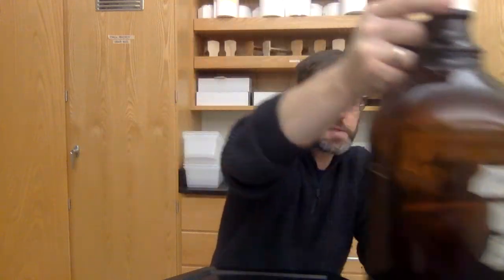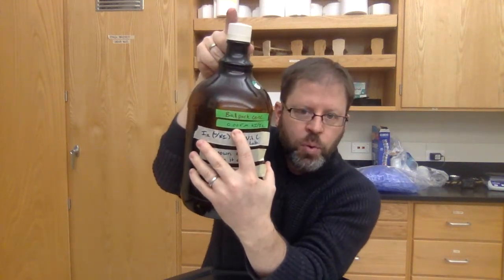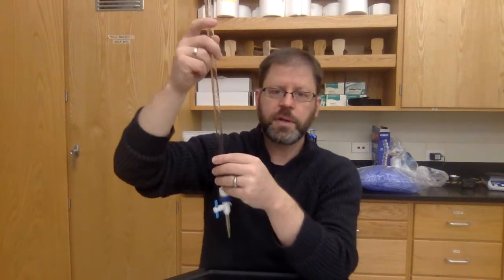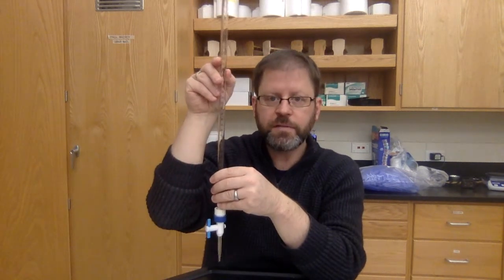So now you're going to have your sample and you're going to titrate it with this guy. Okay? So here's the thing. Again, ballpark, this is 0.005 molar. And you need to do the calculation so that you can approximately have the right amount of vitamin C in here, based all the way back from the 1 gram per tablet, so that when you load up your burette, you're going to use approximately 25 milliliters.